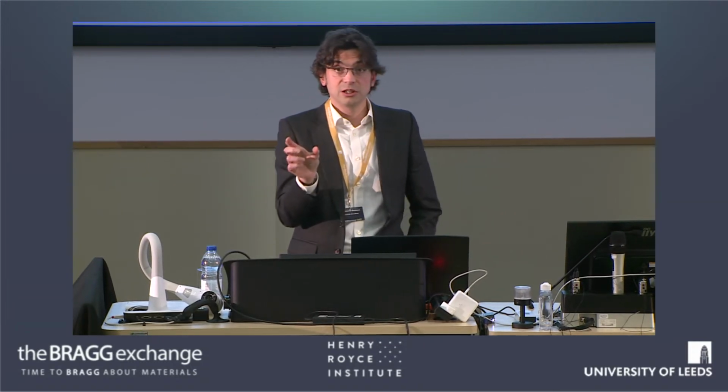The reason it's difficult to make the exact comparison is it's a scanning transmission electron microscope. We have a very high convergence angle, so it's not just one incoming scattering vector or one incoming vector from the electrons and one outgoing scattering vector. You have to do all sorts of integrations, and it gets things a little complex, especially when you tell your theory friends that they'll need to burn their entire allowance of compute hours for the year for the one experiment that you want them to simulate for you.